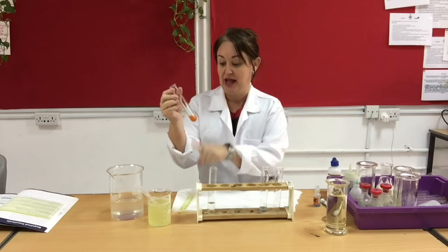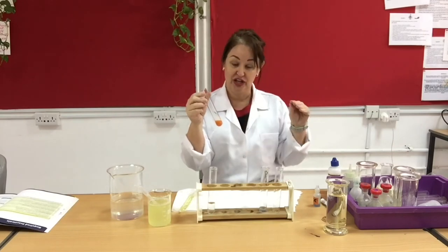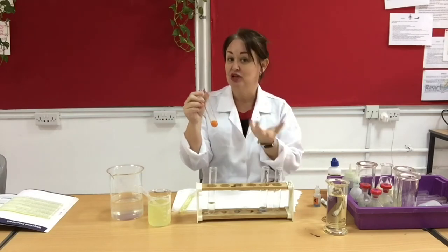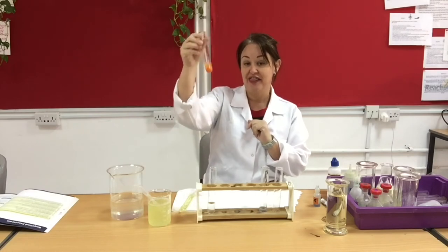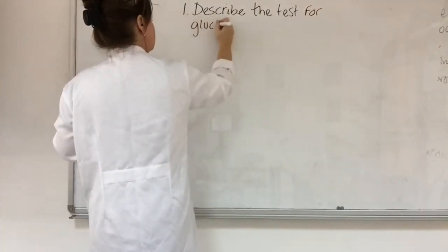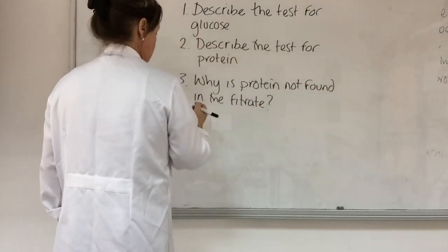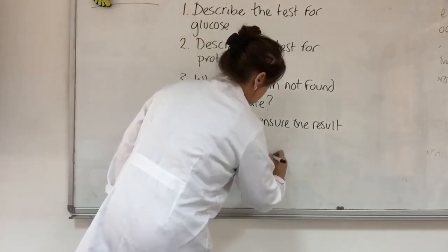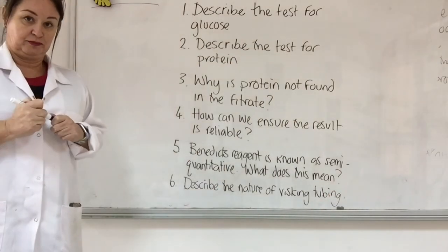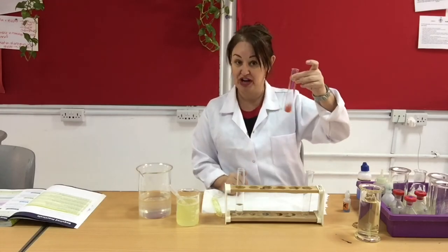I've just retrieved the blood plasma that I was testing for the presence of glucose. I expected to find glucose in there and indeed I have. When Benedict's changes colour, it goes through various stages - green, yellow, and orange - so I'm going to pop that back in because I'm not entirely sure it's finished changing colour just yet, but you can see it's already showing that orange-red colour. I've just taken my filtrate out of the water bath and you can see it's turned to what we call a brick red colour.